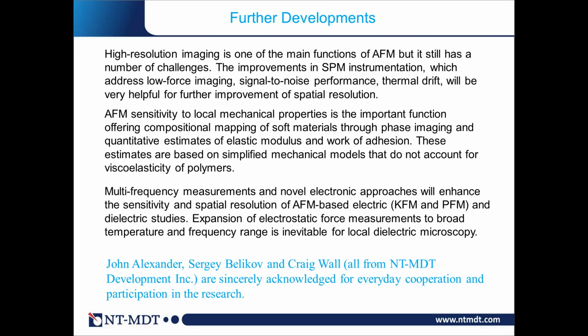Unfortunately, we have not started this work on liquids here in Arizona in our office. We are just looking at different accessories at the moment, and I hope that within some time, let's say half a year, 1 year, I can give you more information about that. But I will put imaging in liquid, imaging cells, and local properties studies as problem number 1 in AFM today.